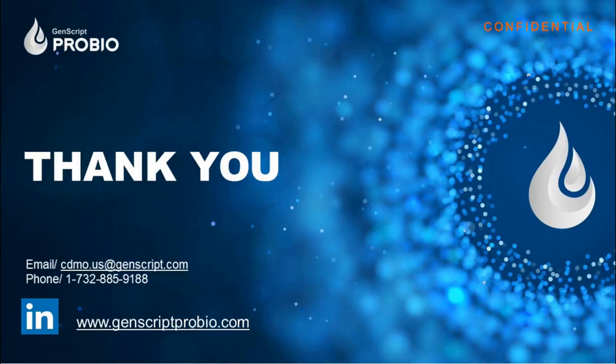In up and downstream, we're looking for representative high throughput scale down models for prediction of the large scale bioprocess and more efficient and fast process development pathways. And in downstream process development, we're also looking for more sophisticated purification and concentration technologies. There's also analytical method development and standardization of the quantification and functional assays, which are critical. We're working on that at this moment.